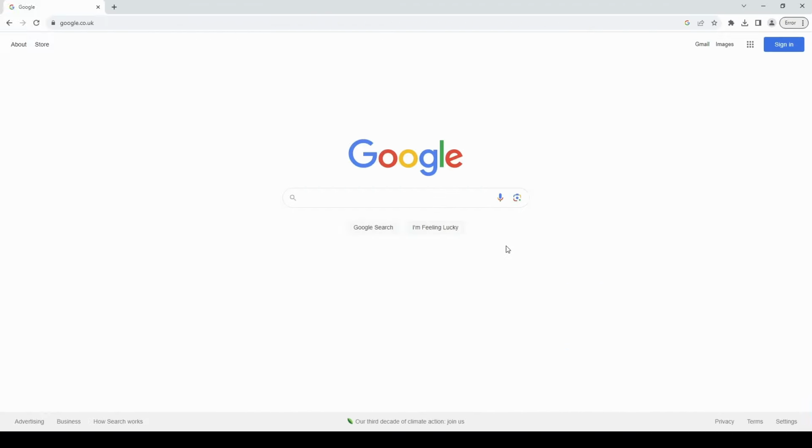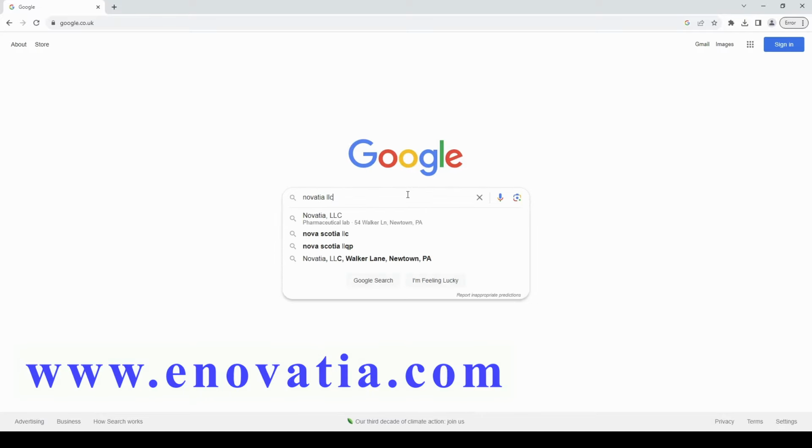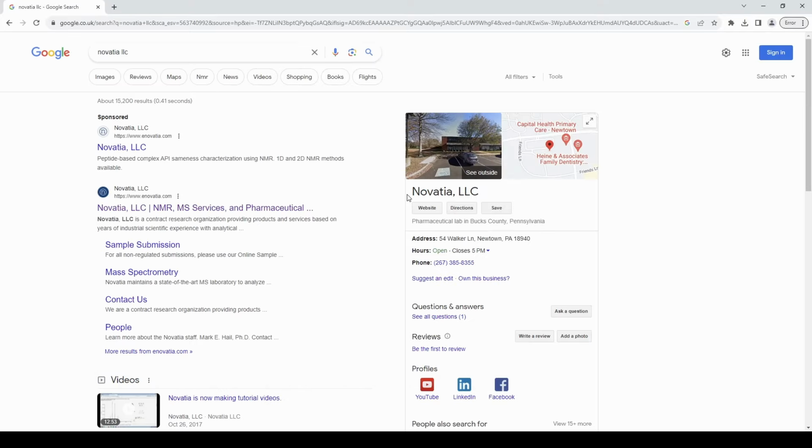You may start by going to our website at www.enovatia.com or by searching Novatia LLC into the Google search bar, as shown. The first result should be our website. Let's go ahead and click on that.